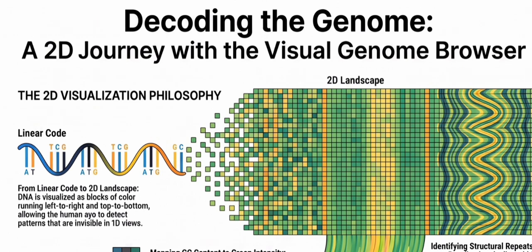But a non-conservative mutation is like trying to swap a standard square Lego block for a large round wheel piece. The entire structure breaks. Yes, if the variant replaces a small and negatively charged amino acid with a massive positively charged one, the physical structure of the protein will likely collapse or malfunction. The software cross-references the chemical properties of the swap and flags it as non-conservative, providing the researcher with immediate, predictive, functional context for a raw sequence variant. It does the heavy lifting and chemical analysis for you.